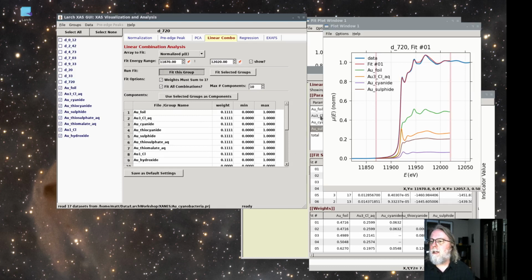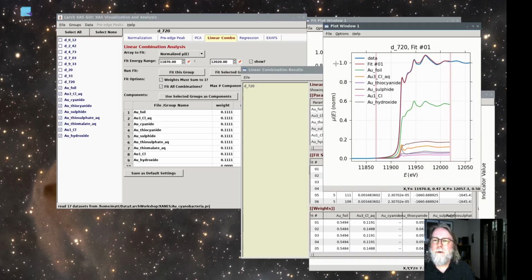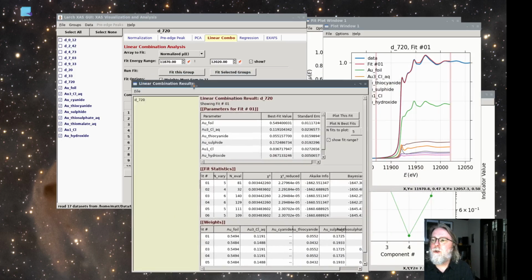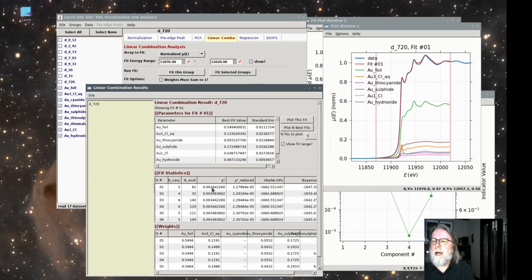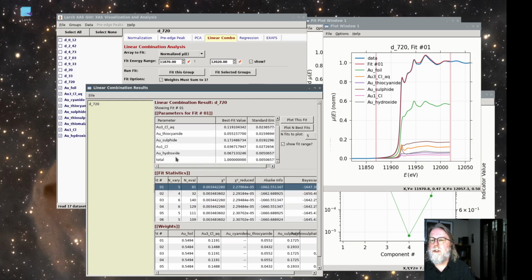This will take a little bit longer. Since it's doing all of the fits of all the combinations, it scales rather poorly as you add more and more components. We sort of knew that there are only 4 or maybe 5 components, and we told it to try 9. So let's see what we get. I'm not sure what the answer is here. So our best fit, and it looks like there's a few that are going to be degenerate in these that really rejected many of the components. So that's interesting. Let's see what got rejected out of this.